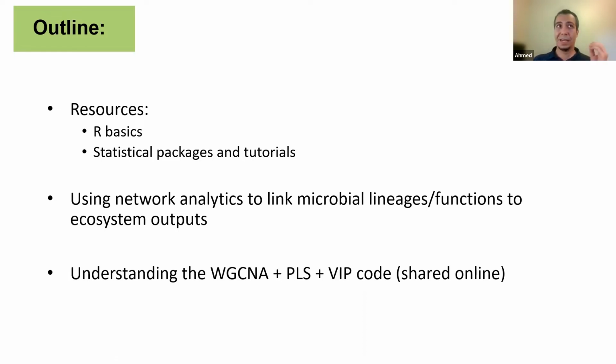It's not like you have one code that will run for every single data set that you will have, and you will expect that you would get the results without really involvement of the user of these codes. So it's really important to understand what are the knobs, where to actually intervene in the code so that you get meaningful results from your data.